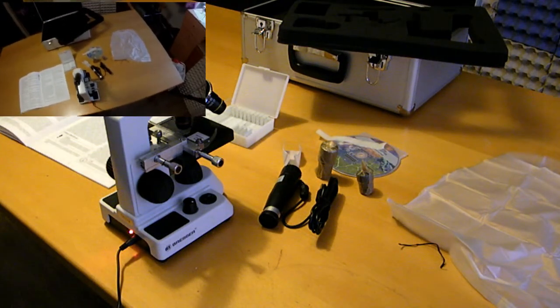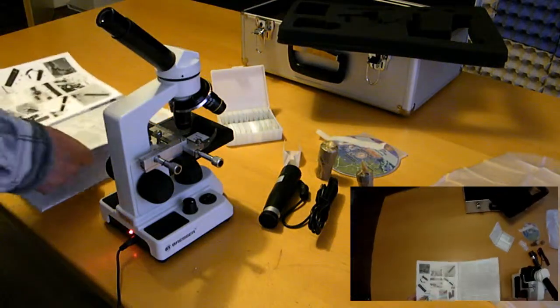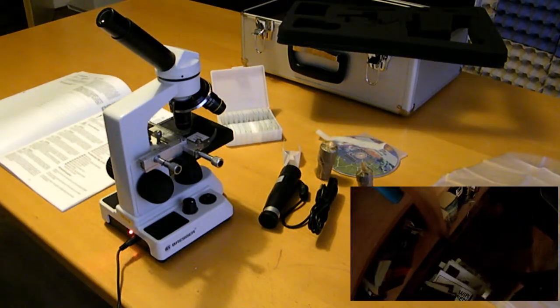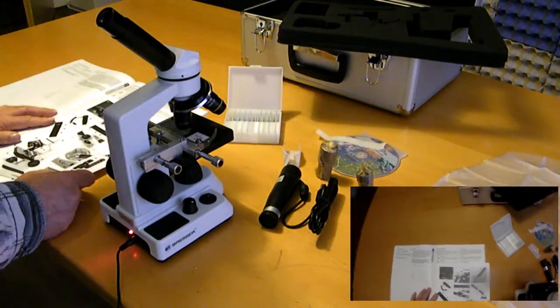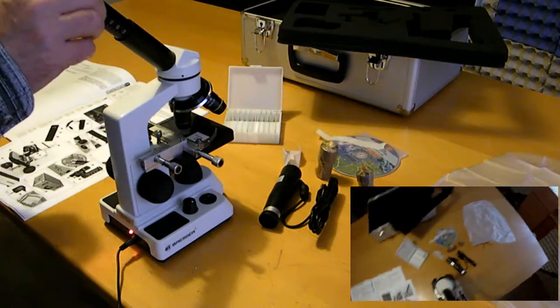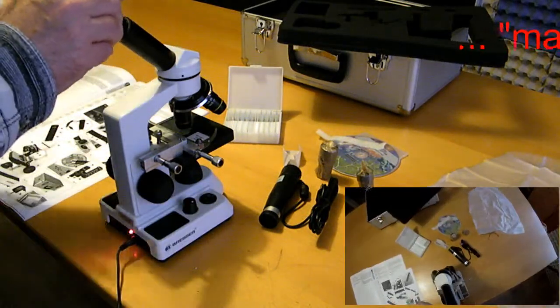now let's have a look at the parts of the microscope and let's find out how they are called. So, I need a picture, here is a picture, okay, I have copied it, it's a better way to work. Where do I have it? Yeah, here it is. Okay. So, let's go through it. One, eyepiece. Yes. Okay, my eyepiece. Yeah, of course. This is the eyepiece. The Barlow lens. I know already where the eyepiece is inserted into. And here there is a scale, and with this scale you can change the factor of the whole setup. Okay.